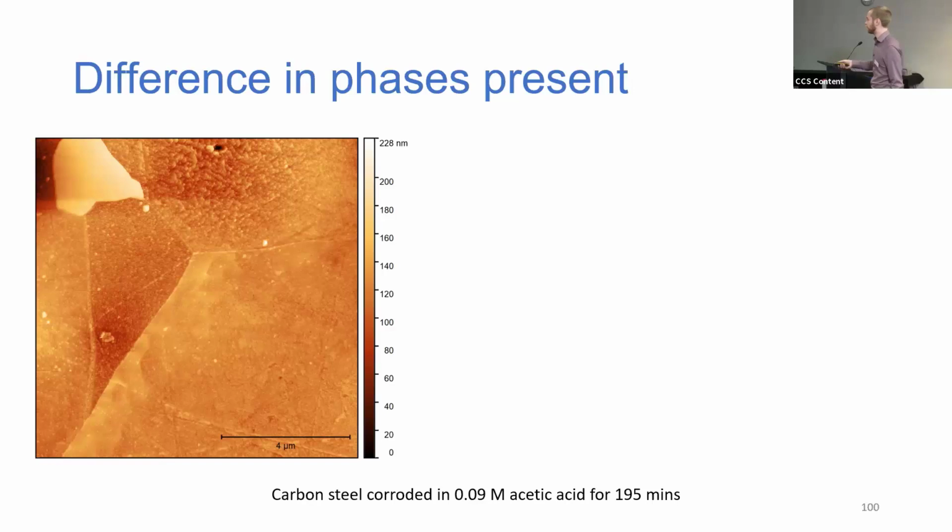I can't tell my right and left at the moment. This feature sticks out quite a lot. In initial experiments, we thought these were artifacts because these were much smaller generally. But seeing such a large one, we thought maybe there is something more to this.